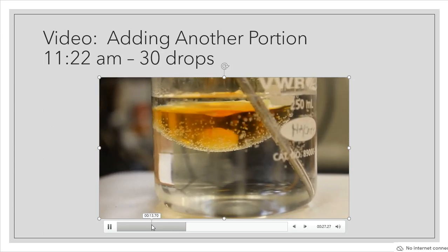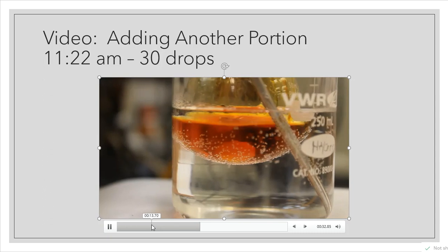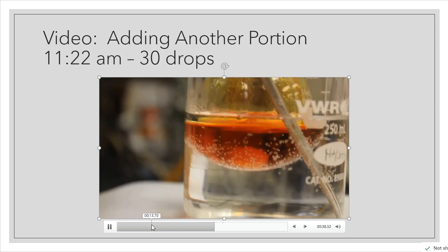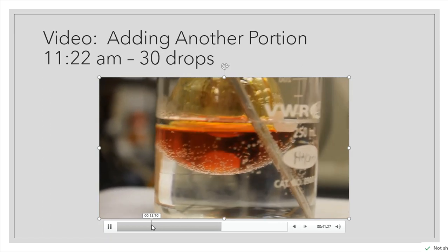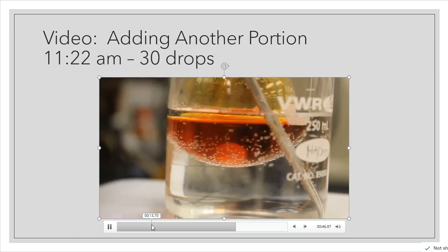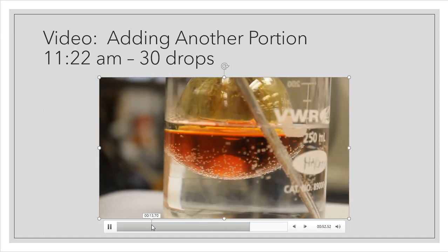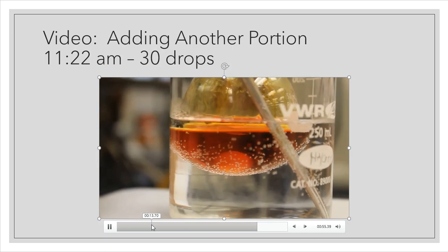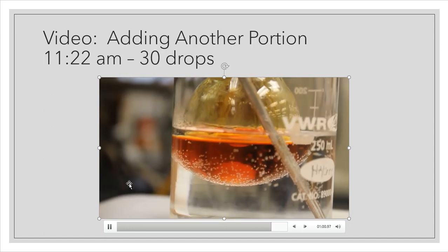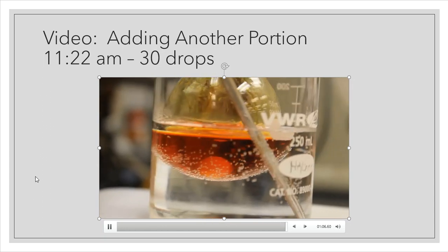And as I begin to add, I want you to see the color change that begins to happen. Notice this is not a golden color anymore. This is really now a very deep, kind of dark orange, almost red color. So I add about 30 drops, and then I cut the flow off. I allow this to continue to react slowly. And then when I get that very pale, golden, light orange color, I'll just add my final portion at this point. So this was my fourth addition, and I've got about one more left in me before I get ready to go on to the next part of the lab procedure.